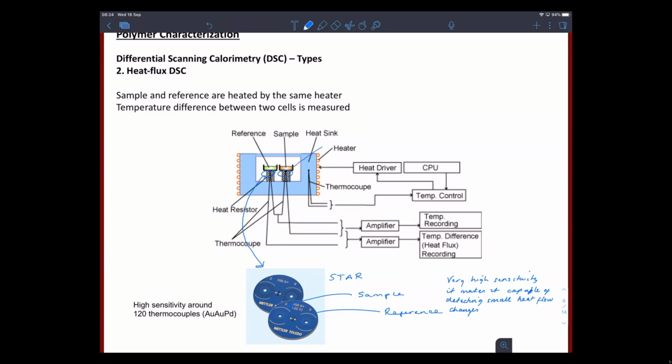So the other thing to touch on is the use of the crucibles at this point. Our sample pans or containers, there are many different types of crucibles that you can use, and they're available depending on the polymer or whatever sample you're trying to measure. We're touching on polymers, but these can be used for other phase transition measurements, not exclusively for polymers.